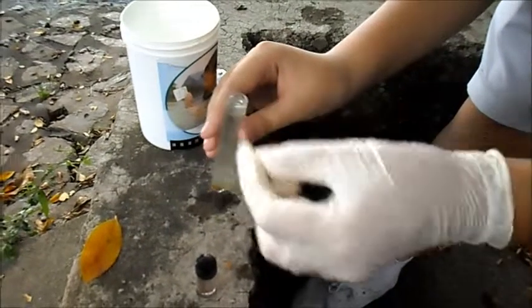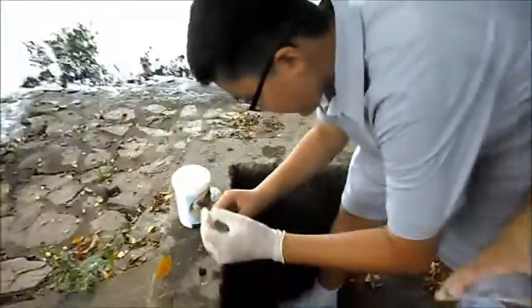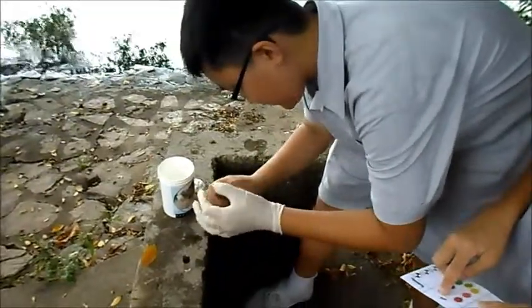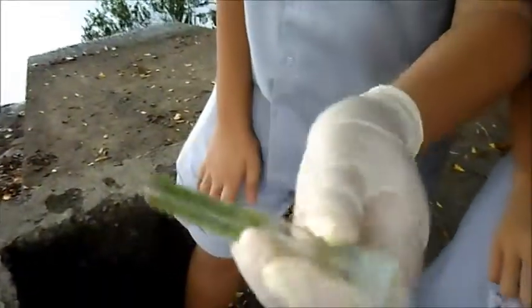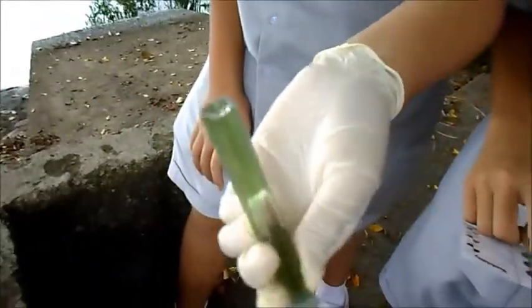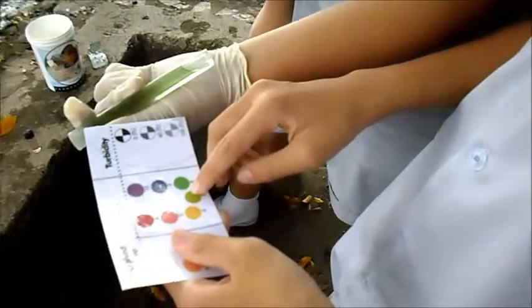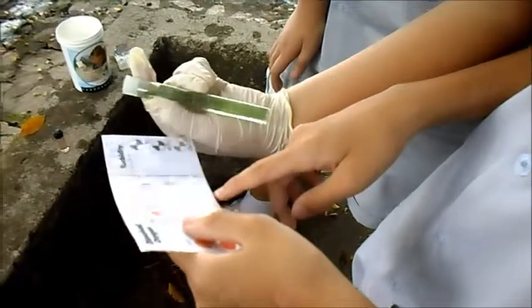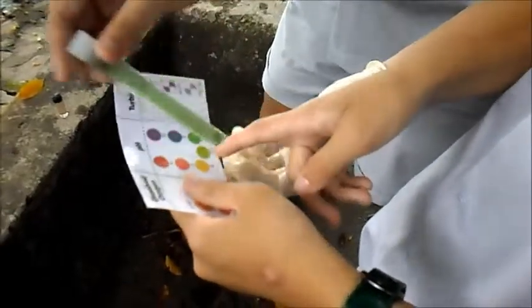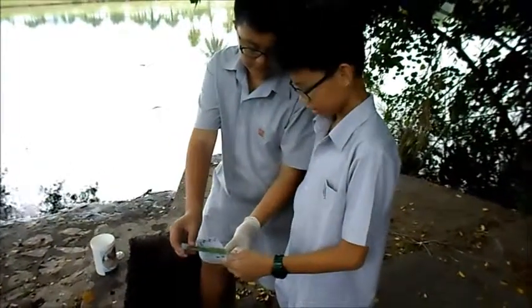Tablet. This one. On top of it. Put the cup below the bottom. Then you can measure. This one. Okay, so what's the reading? 7.